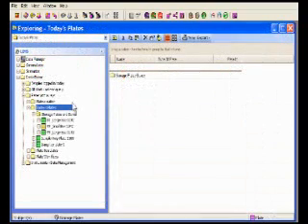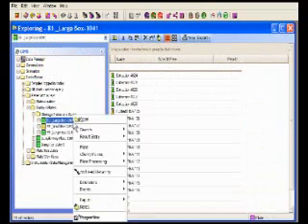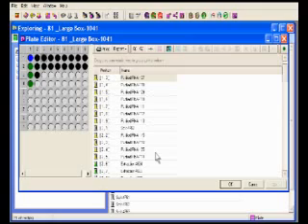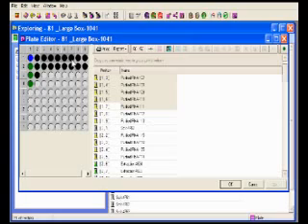A simple right-click on a plate or box provides access to the graphical plate editor, where users can manually update elements. Users can easily create a new plate on the fly, or choose from a series of templates and workflows.